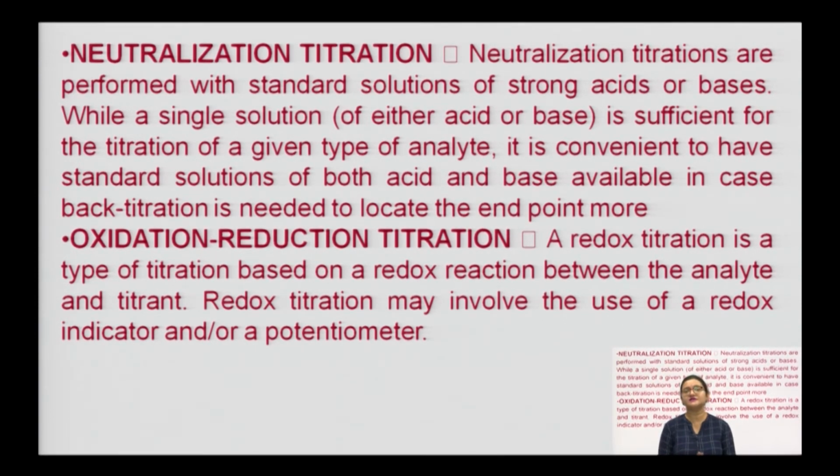Why does the pH change at the end point in a neutralization reaction? The sudden change in pH shows a sudden rise or fall in the concentration of H plus ion, or the acidity or basicity of the solution, which indirectly shows our end point. Okay? So, it can be applicable for those sorts of titration also. It can be very well applied to redox titrations also.